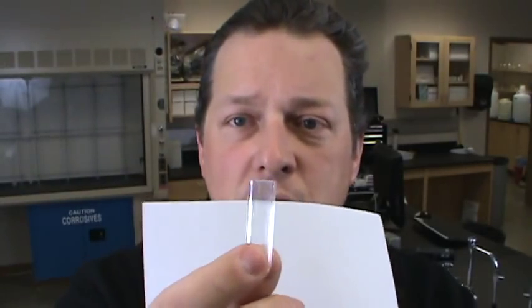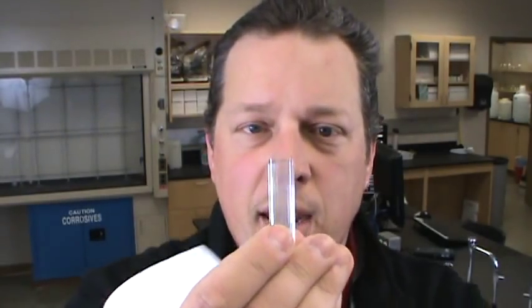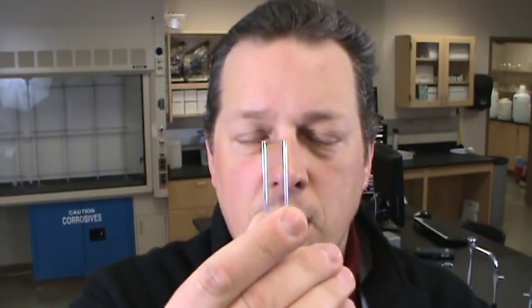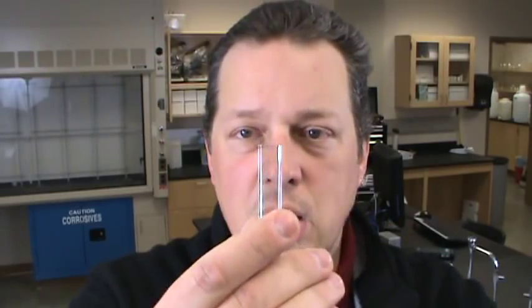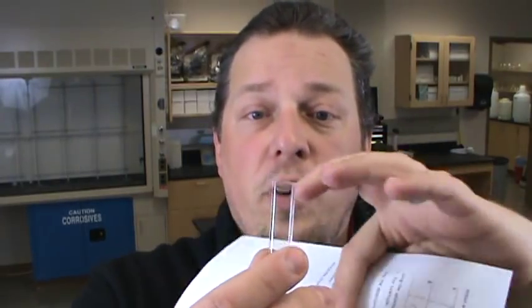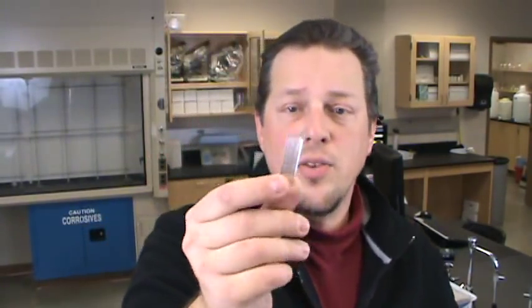So you can see on the cuvette, let's see if this shows up, that shows up pretty well. There are two sides that have some markings and some lines on them that aren't very transparent. There are two sides that are very clear. So we always have to make sure that we're shining light through the clear faces when we want to do this type of an experiment, and not turning it and shining it through the patterned faces, because that will definitely cause some trouble. So that's what our sample is going to be held in, a small little plastic cuvette. These are plastic cuvettes. So let's take a look at how to get those set up in the experiment.